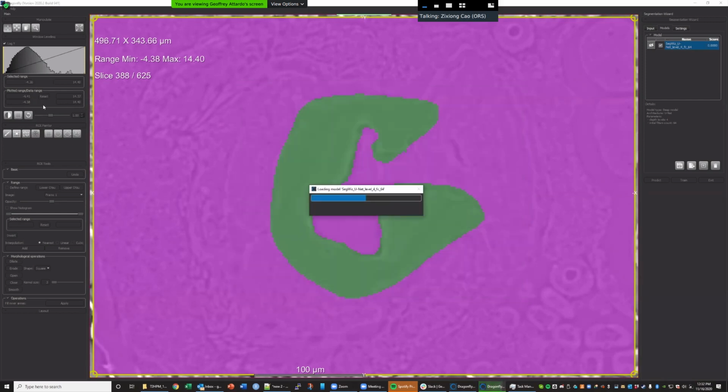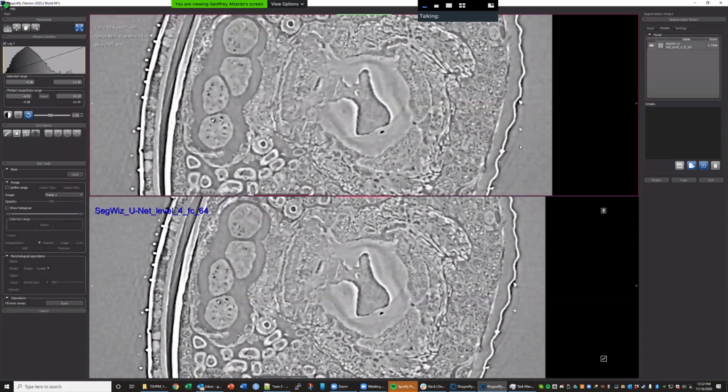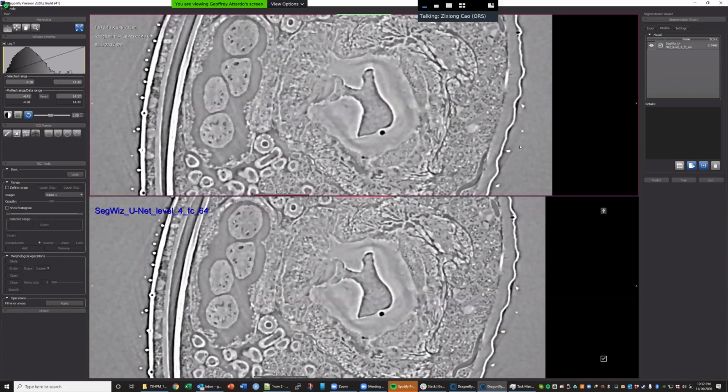What I know is we will always normalize the total range from 0 to 1. No, it still doesn't give anything. Well, this is something I didn't expect for sure. And I will confirm with our developer about the normalization, about the range.